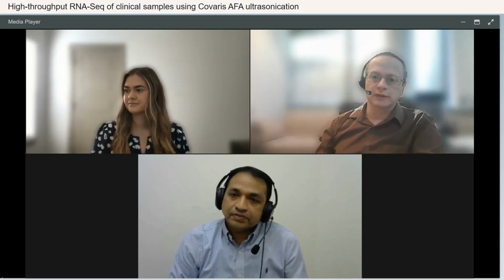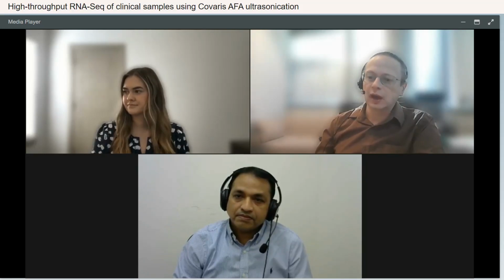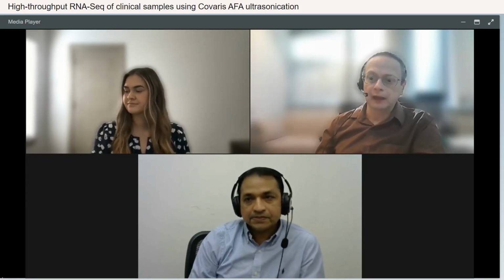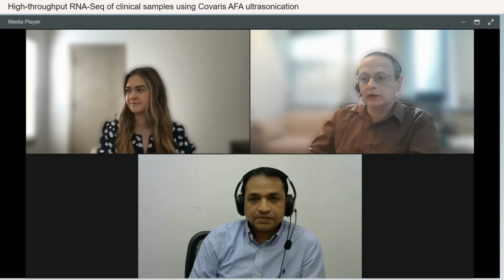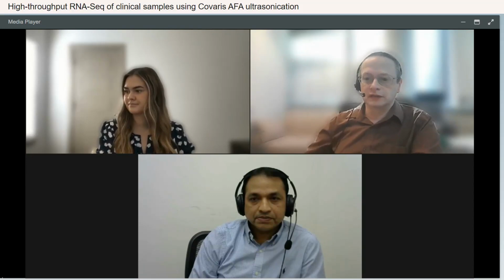Part of the challenge has been the speed at which you can get the data. Part of the challenge has been interpreting that data in a way that's meaningful to the researchers. Being able to standardize and lower the price of that type of RNA-Seq, I think, would be helpful in using this data more actively in the clinic. There are places where it's probably much more relevant. Cancer, for example, is a disease of the genome.